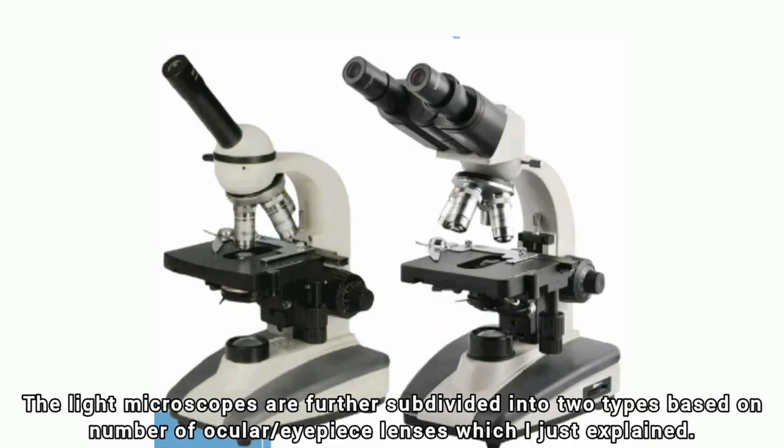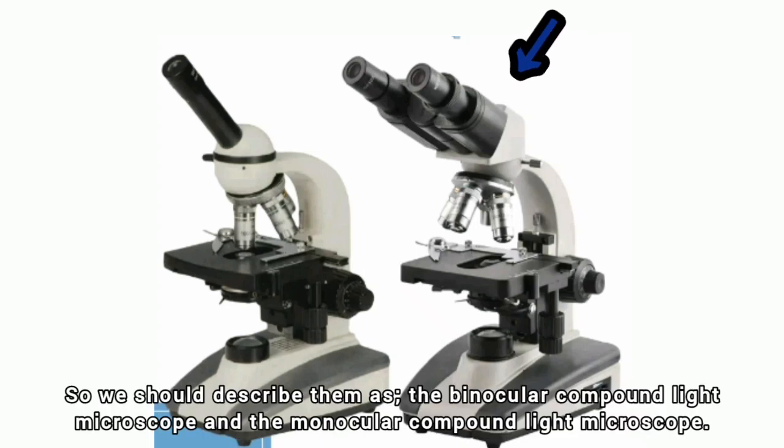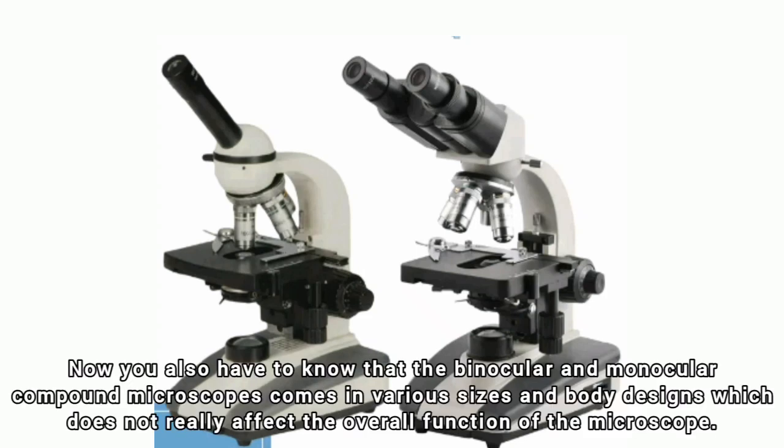The light microscopes are further subdivided into two types based on number of ocular or eyepiece lenses, which I just explained. So you should describe them as the binocular compound light microscope and the monocular compound light microscope. Now you also have to know that the binocular and monocular compound microscopes come in various sizes and body designs, which does not really affect the overall function of the microscope.